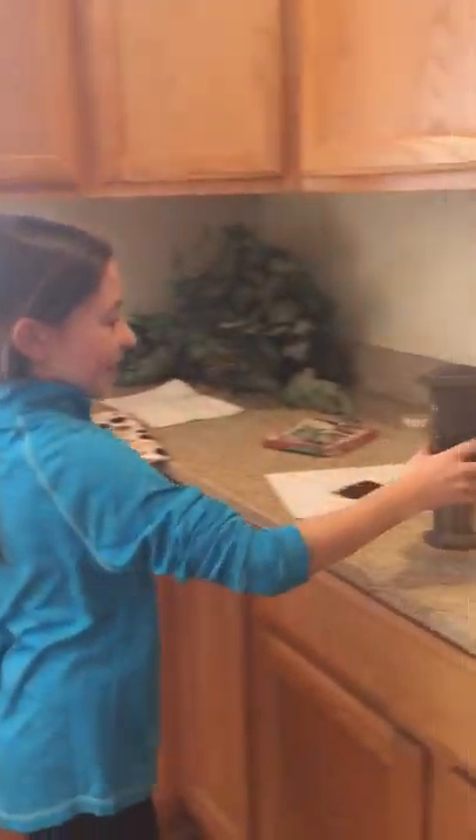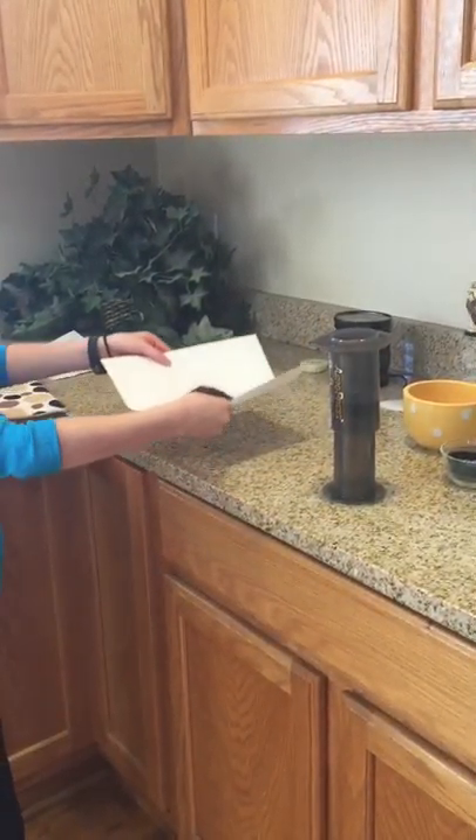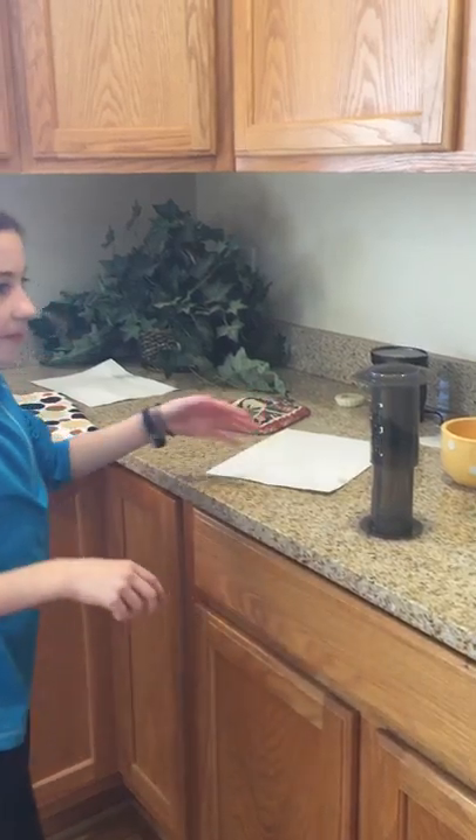And then you're going to pour it in the sink. And then now you're going to pour the coffee in the big one. And you're going to pour some water.